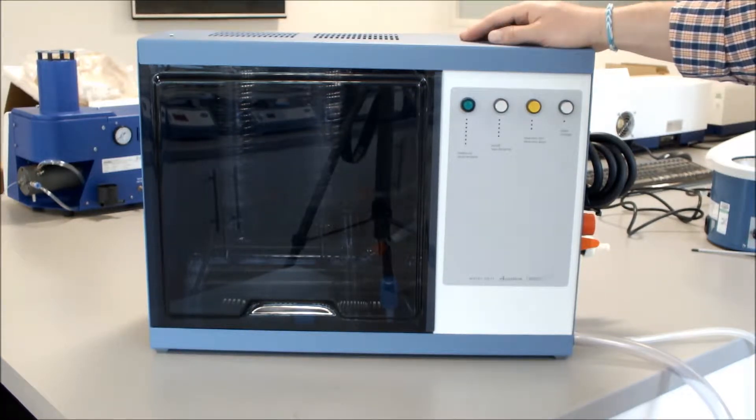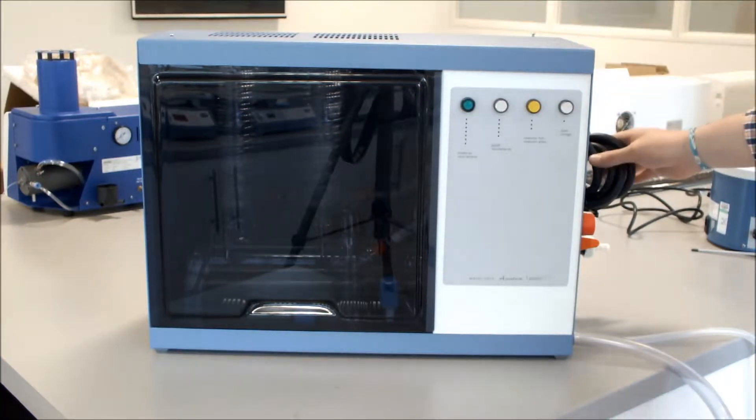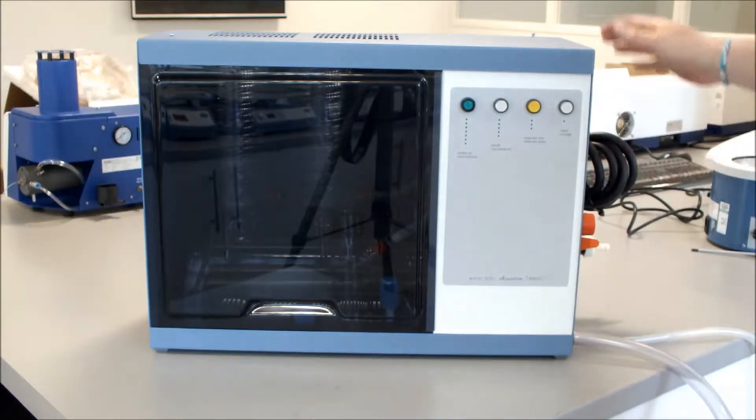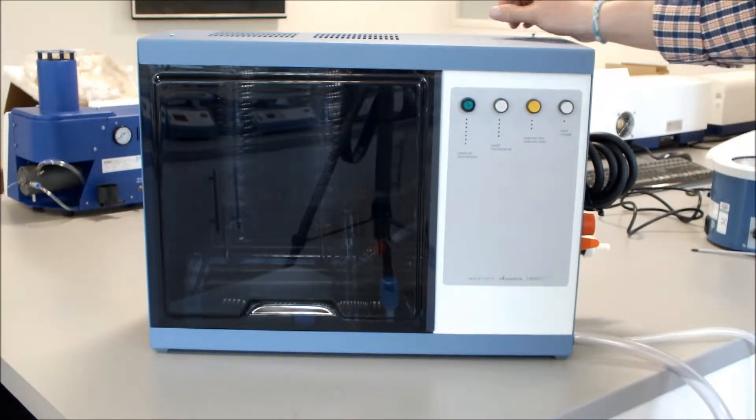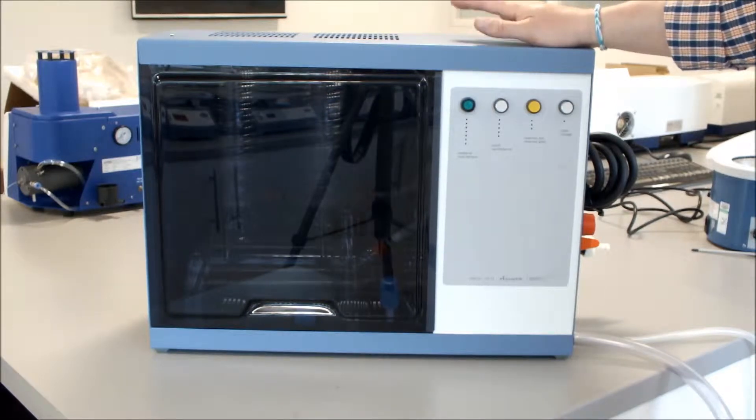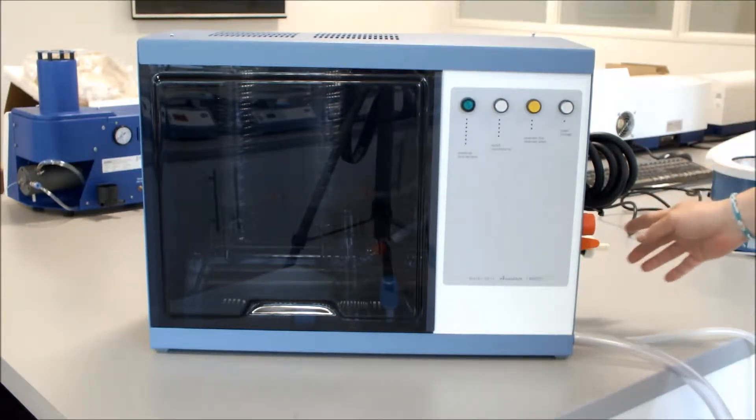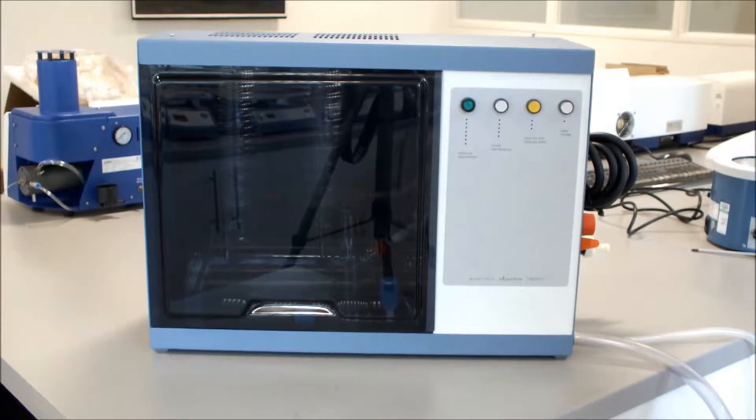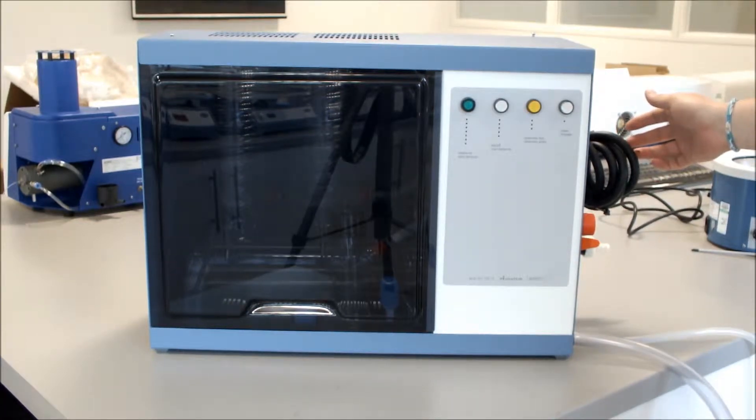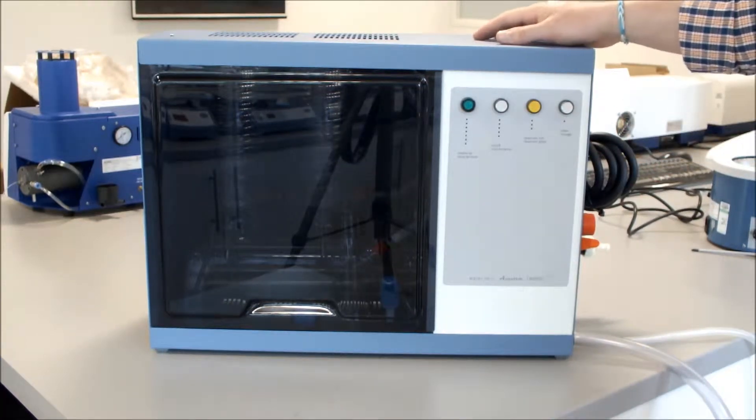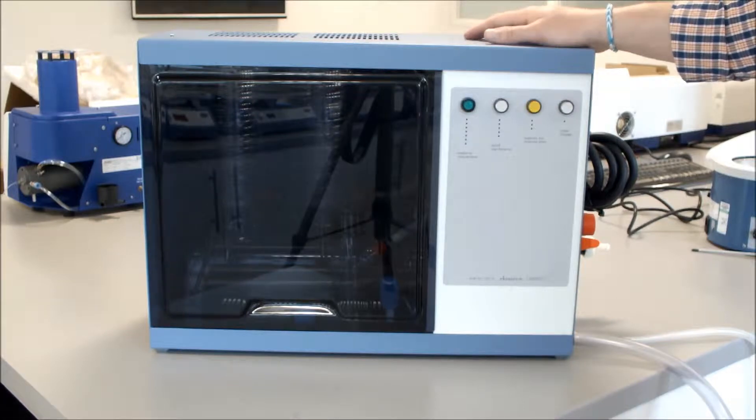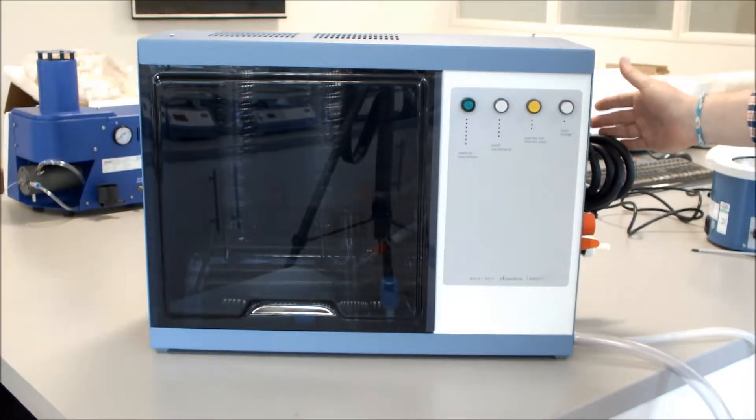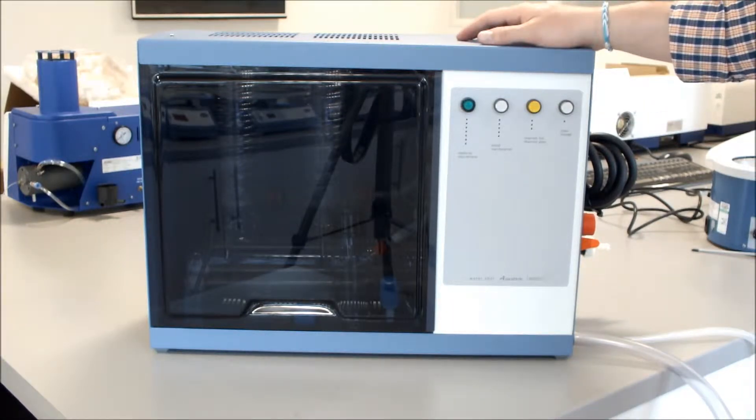The first thing we need to do is check that the electrics are disconnected from the unit and it is electrically safe to actually work on. There is no mains water connected, as you can see, no electrics connected. This is a new unit. Your unit is probably connected, so ensure that it is disconnected before you do any maintenance on it.